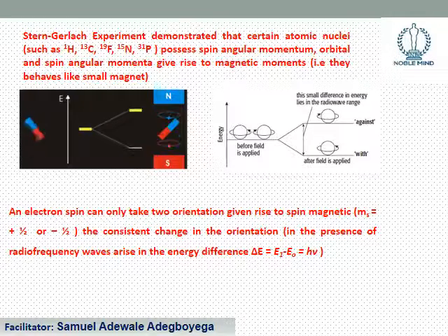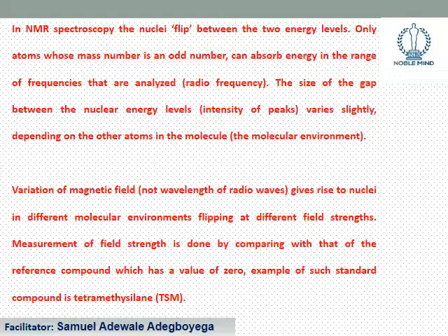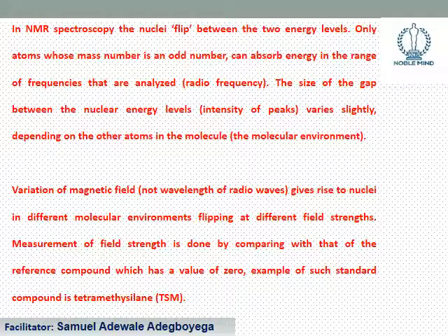And you remember that in our previous studies we have earlier calculated the change in energy as Planck's constant multiplied by frequency.